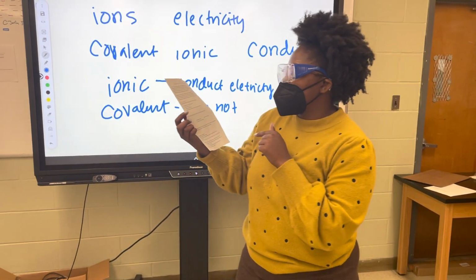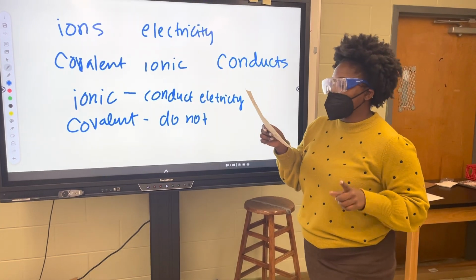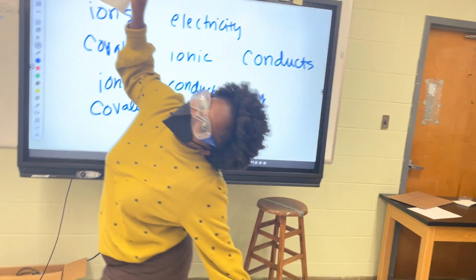All right. So the problem of the day is, how can the conductivity of a solution help you classify the bonds in the solute? That's what we're going to do. Safety. Got my goggles on. Let's go over and complete this.